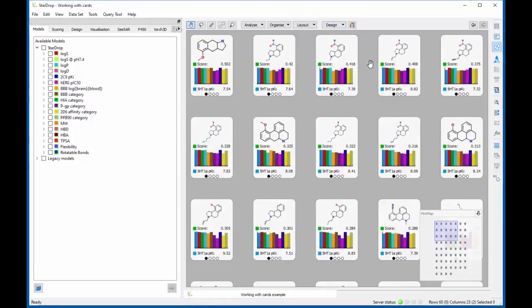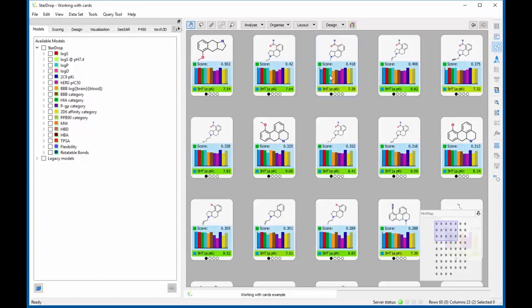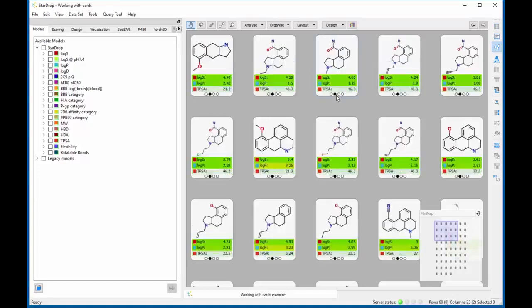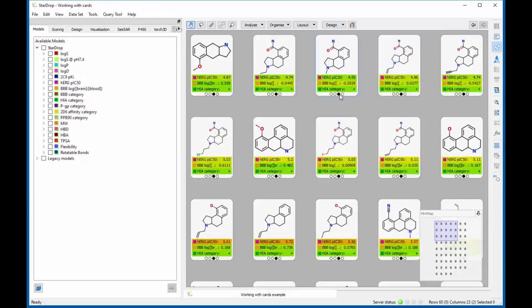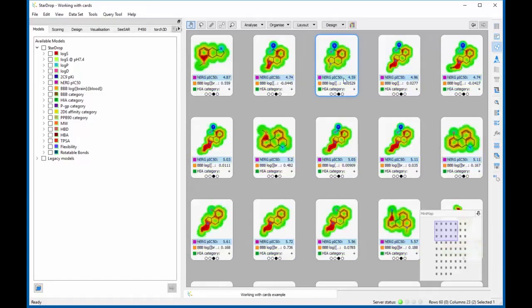Clicking on the data displayed on cards can show additional information. For example, clicking on a scoring profile will show a heatmap of the contributions of each property to the overall score. Also, clicking on a predicted property will show the glowing molecule for that property on each card to highlight important SAR.